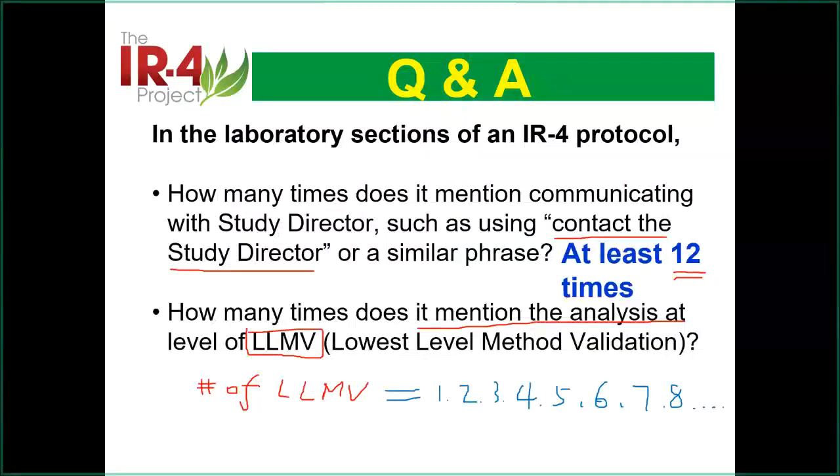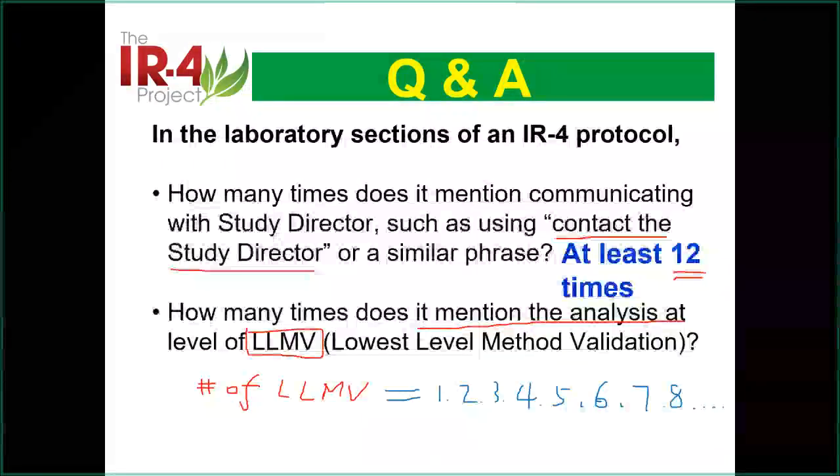You cannot change. To say that short, basically, no, you cannot change the extraction method. It's not that you want to do another validation. Well, of course, if the reference method doesn't work, you can do it, but you need to get several levels of approval. The study director needs to say yes, and you need to talk to the registrant, the companies need to say okay, and possibly you need to have some communication with EPA.